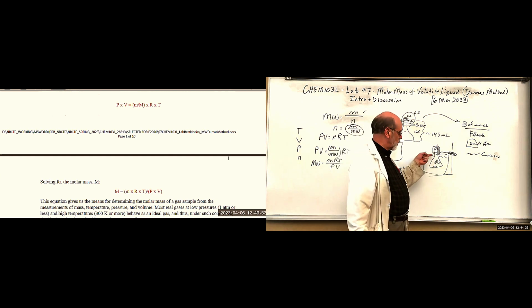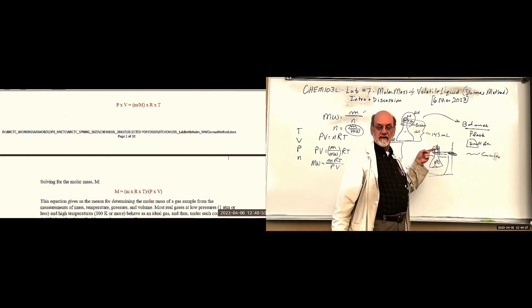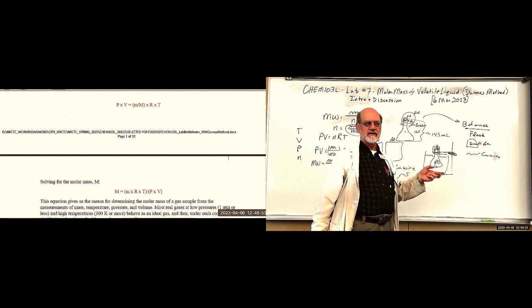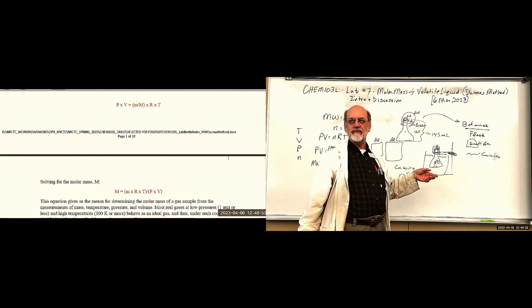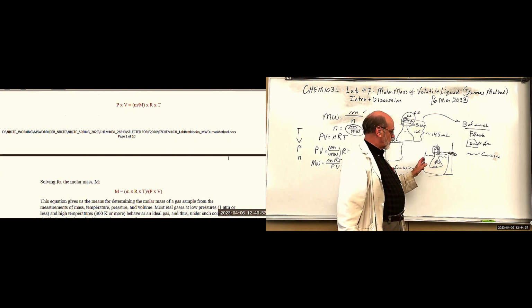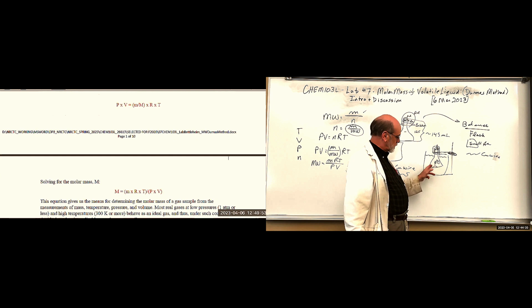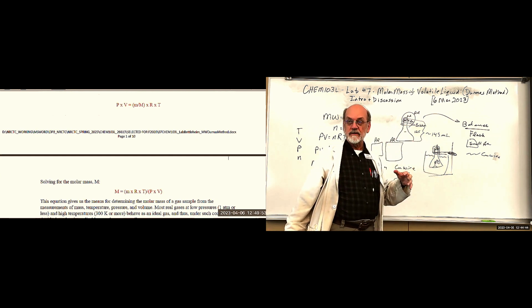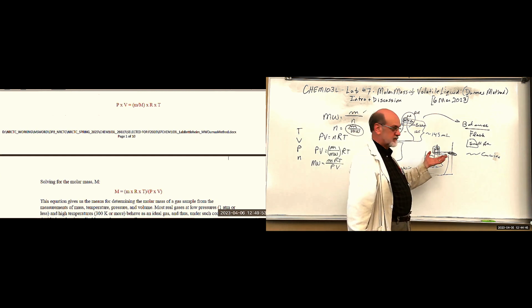So the only thing you want in this flask is the liquid vapor. That sounds like a contradiction. Vapor derived from the liquid. So once we waited long enough for all of this liquid to vaporize and this whole cavity is full of the vapor, then you can take it out.